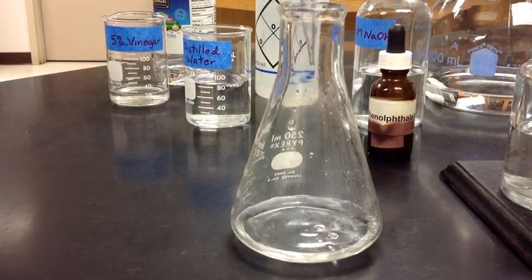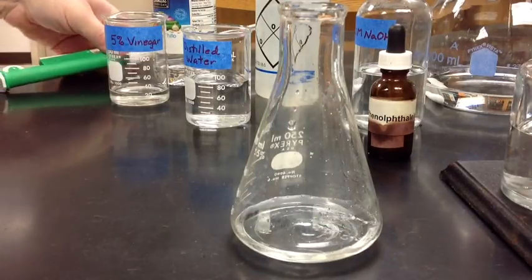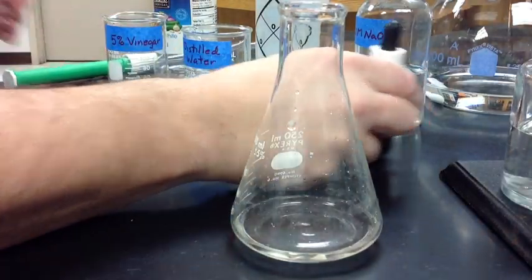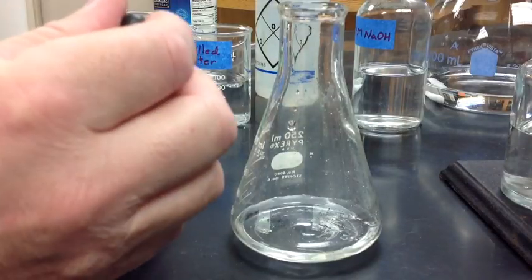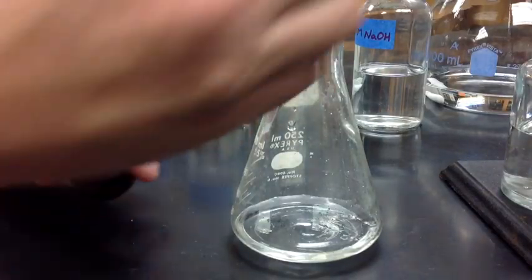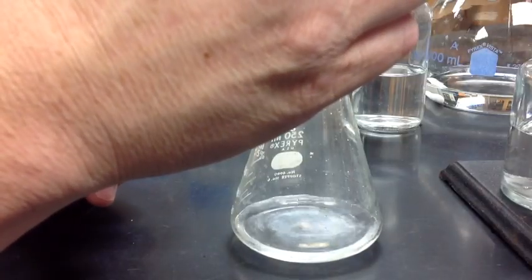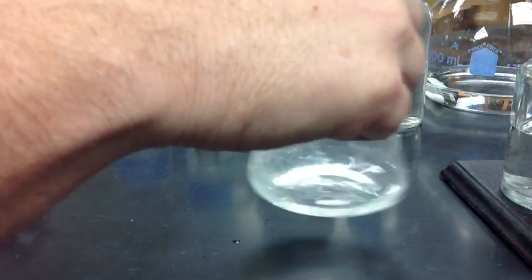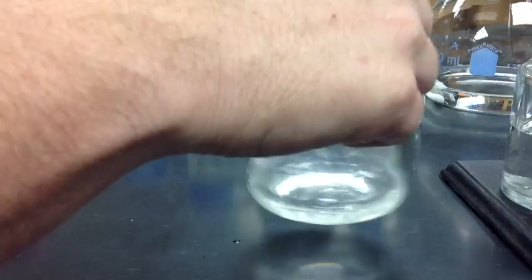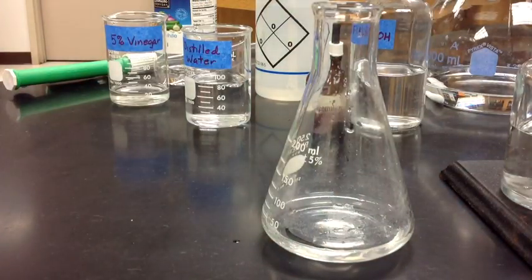Now we have our 25 milliliter solution — 5 milliliters of vinegar and 20 milliliters of water — and to that we will add 5 drops of phenolphthalein solution. Notice it clouds up a little bit, but if you swirl it around, it will go clear because phenolphthalein is clear in an acid solution.